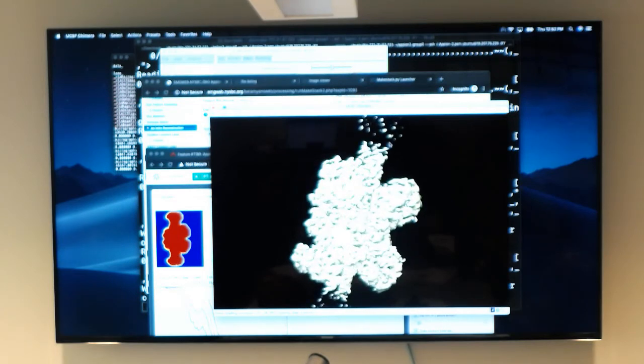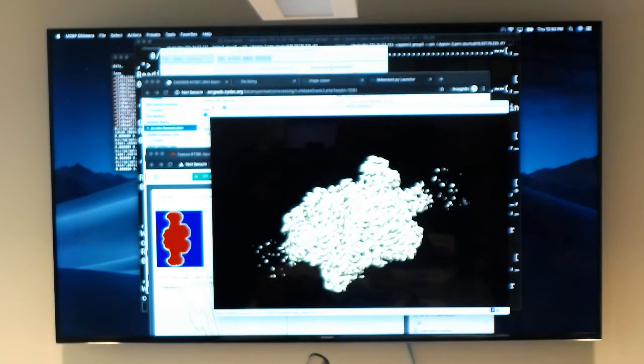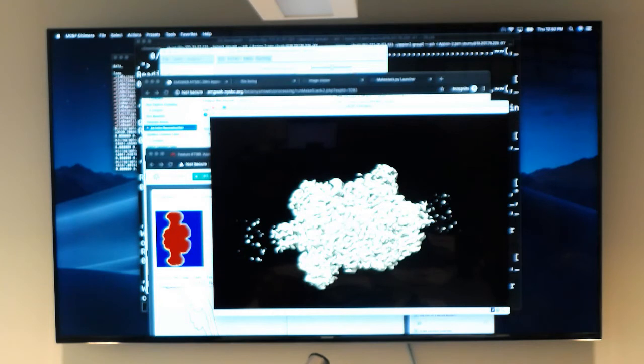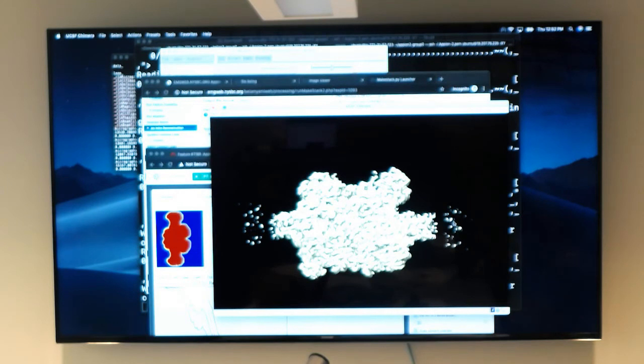You may not have seen some of the raw micrographs, but the way the particles work, there's this particle and there's another one over here. So this is actually from a neighboring particle. But let's say this is a region I was interested in. Then something you can do is focused classification, masking certain areas out and looking at here.